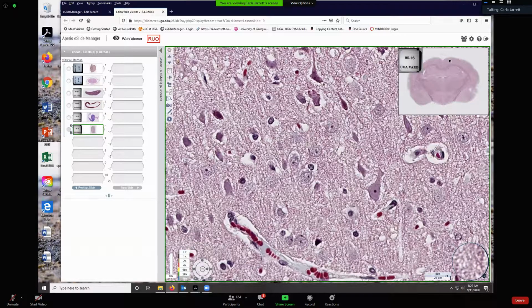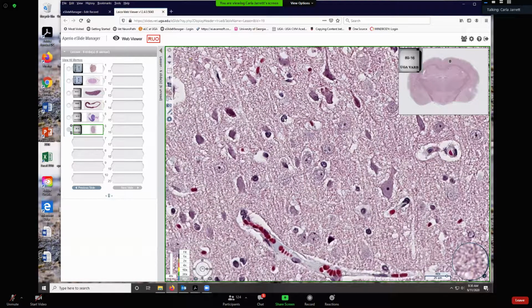We don't see its cytoplasm. Here's a round neuron, and see it's right here where we call these perineuronal satellite cells. You know, they just live right within orbit, if you will, like a satellite of these neurons, and they provide a support function to these neurons. So here's an oligodendrocyte nucleus. Here's one, here's one, here's one.